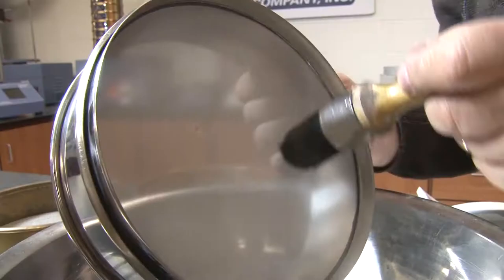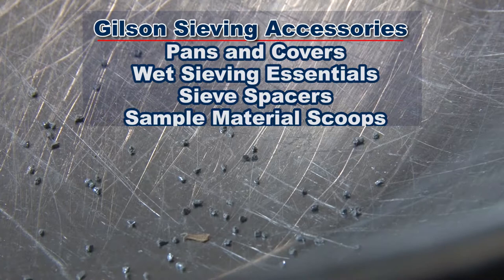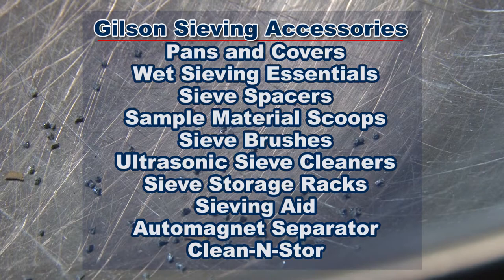Gilson's complete selection of sieving accessories help you clean, maintain, and store your test sieves, such as Gilson's extensive selection of sieve pans and covers, scoops, sieve brushes, ultrasonic cleaners, and much more.